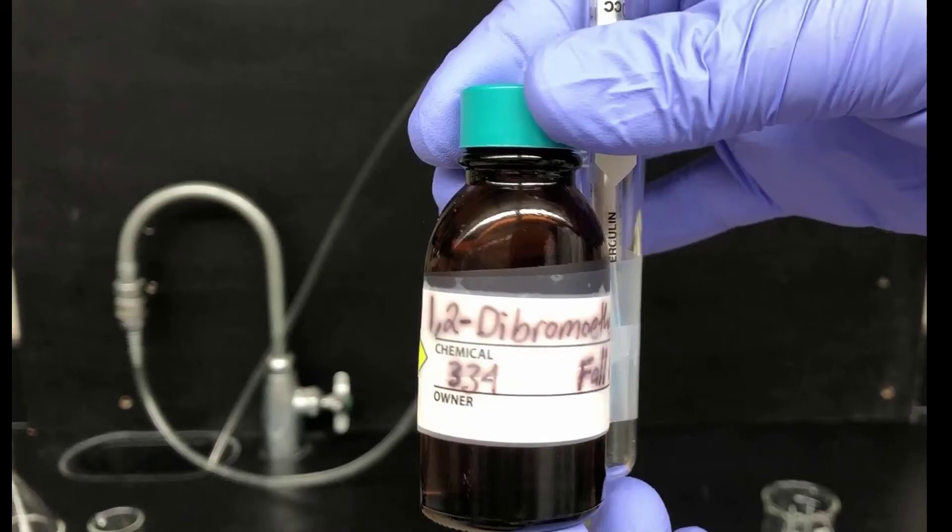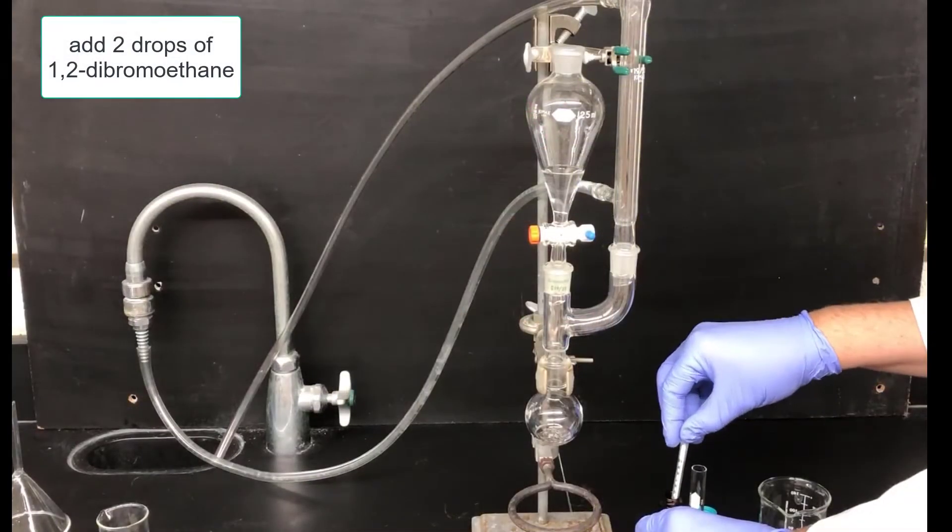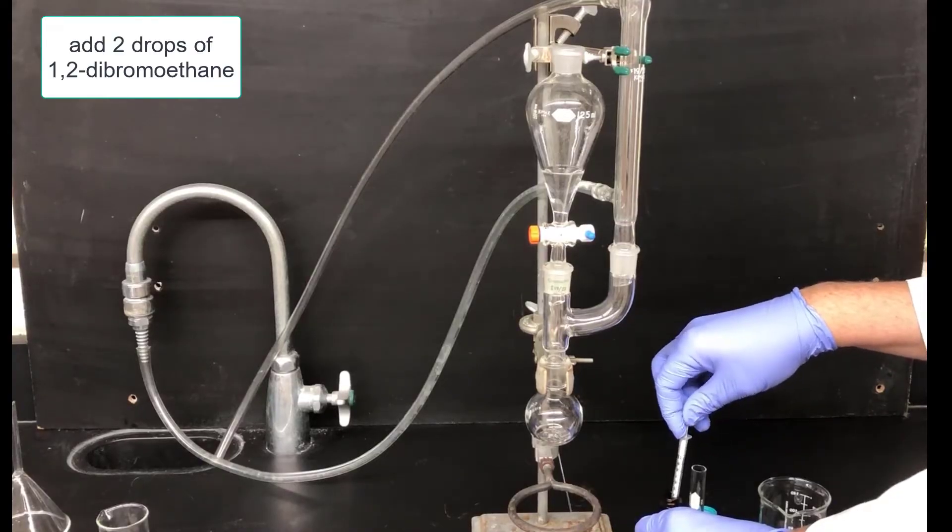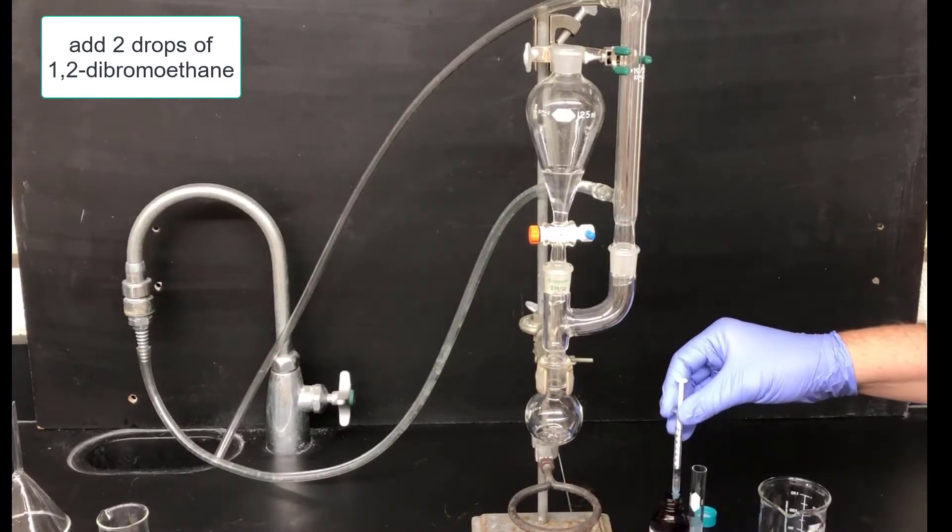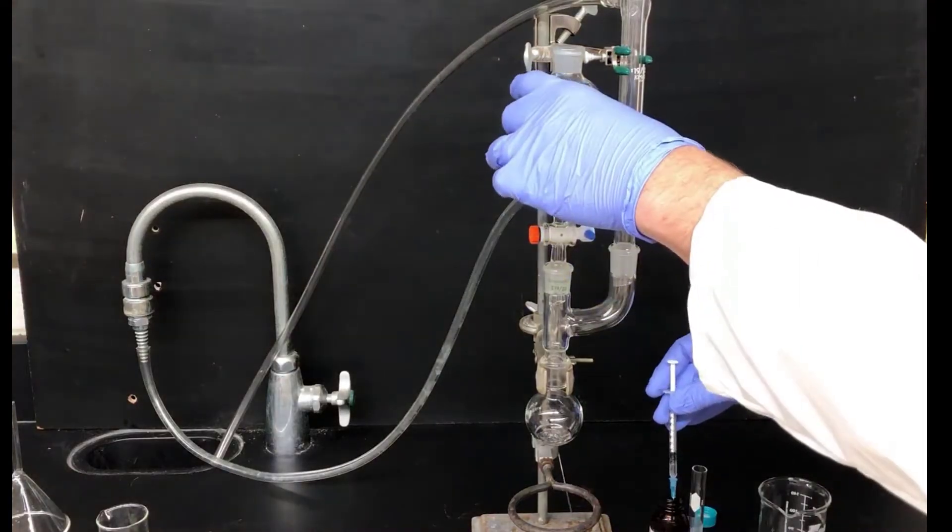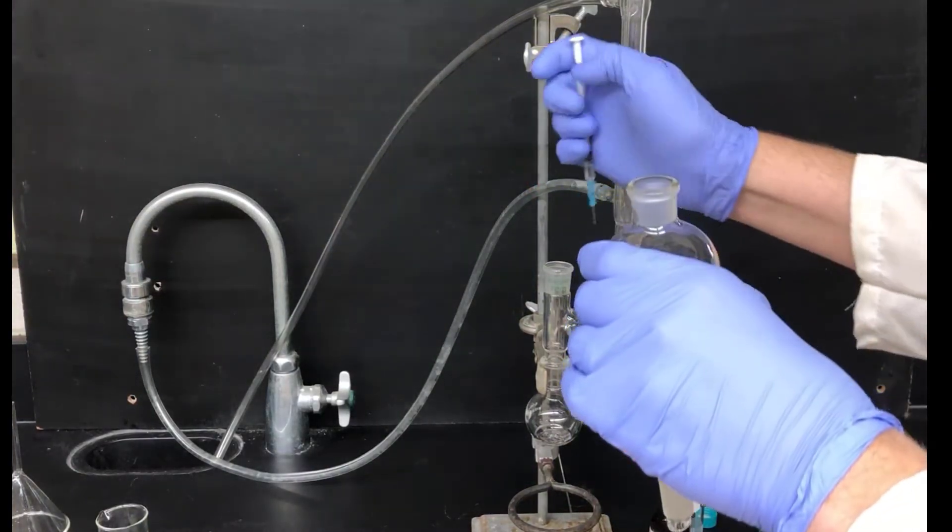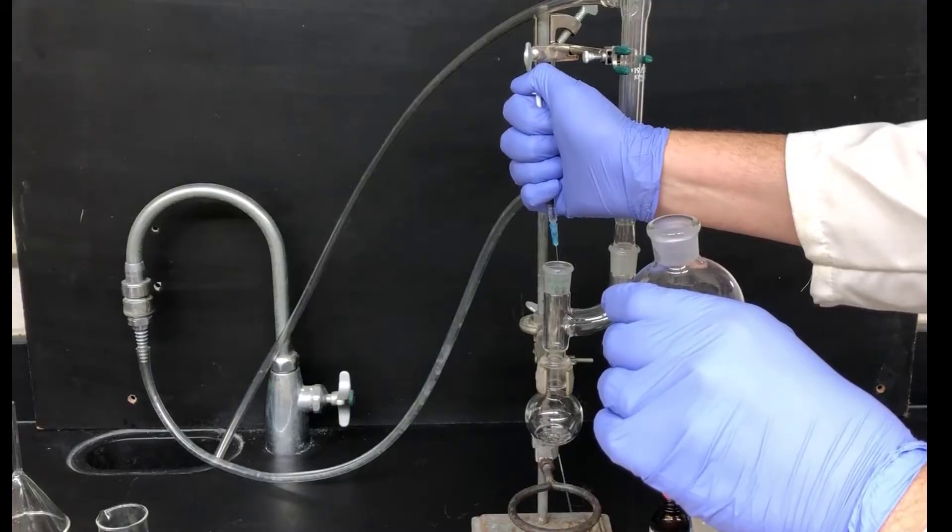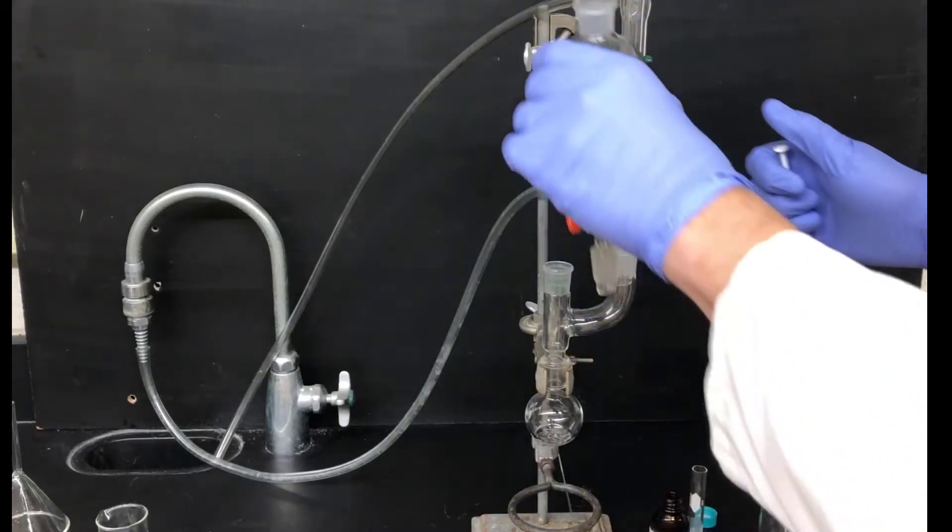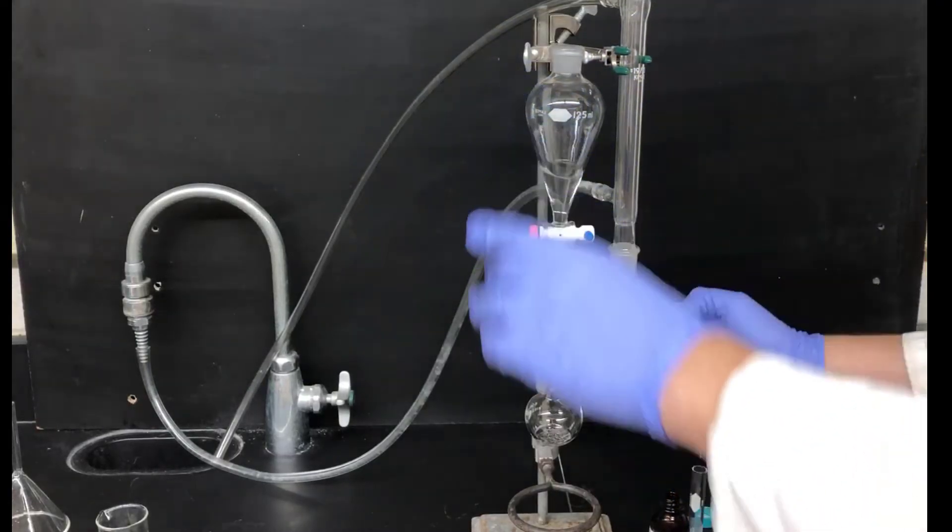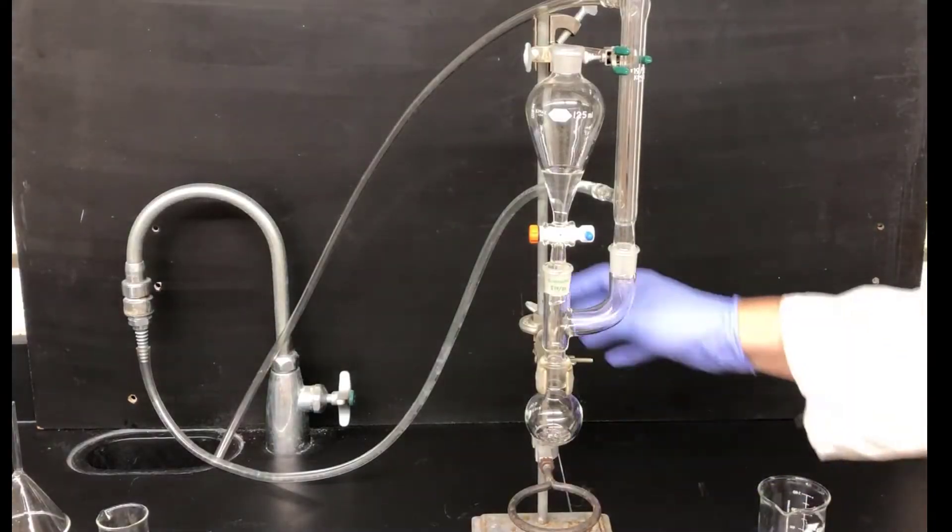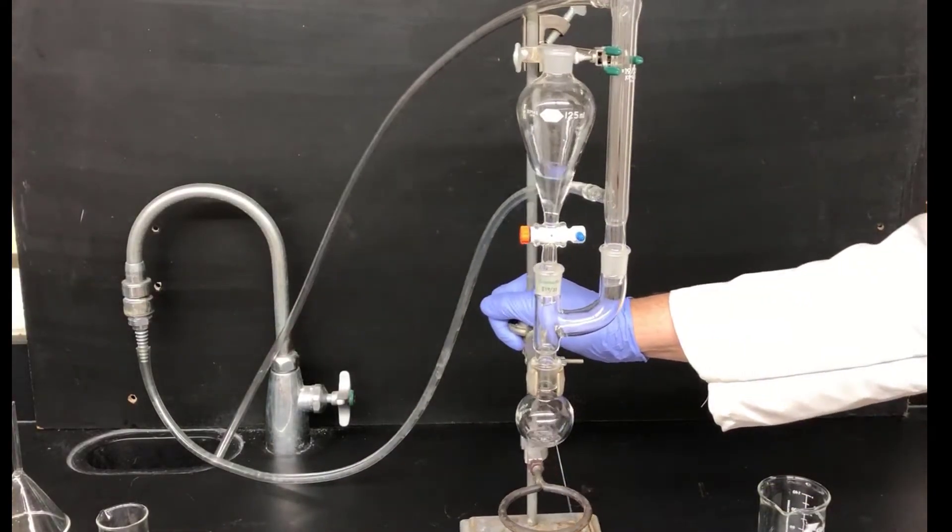To help initiate the formation of the Grignard reagent, I'll be adding two drops of 1,2-dibromoethane. This reagent reacts with magnesium metal, exposing fresh magnesium surface, allowing the Grignard reagent formation reaction to start more easily. I'll just remove the addition funnel temporarily, and add two drops of the 1,2-dibromoethane down the hole. Make sure that the drops actually fall into the solution and don't get hung up on the side of the glassware. Now I'm shaking the apparatus a little bit to stir everything up.